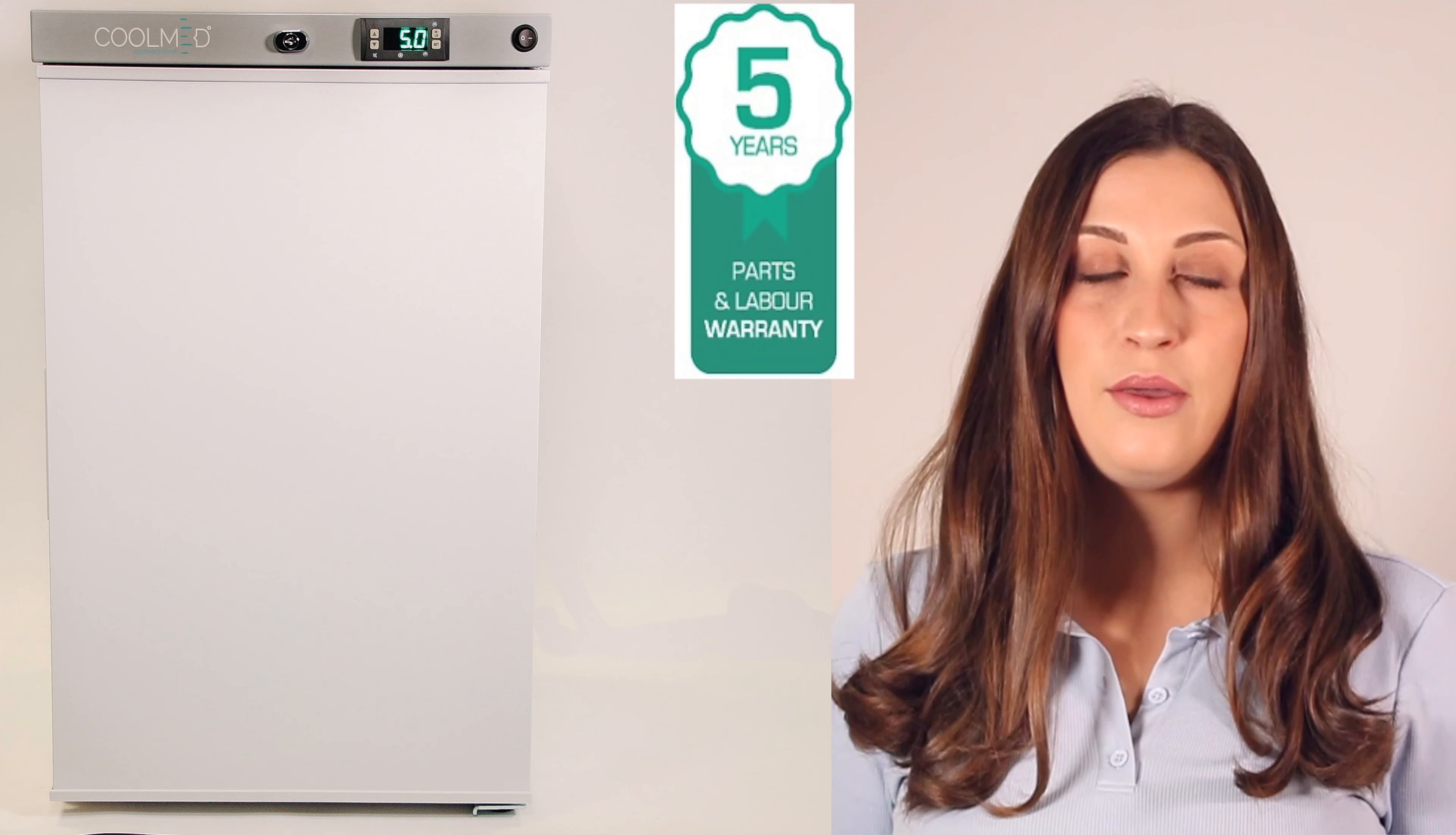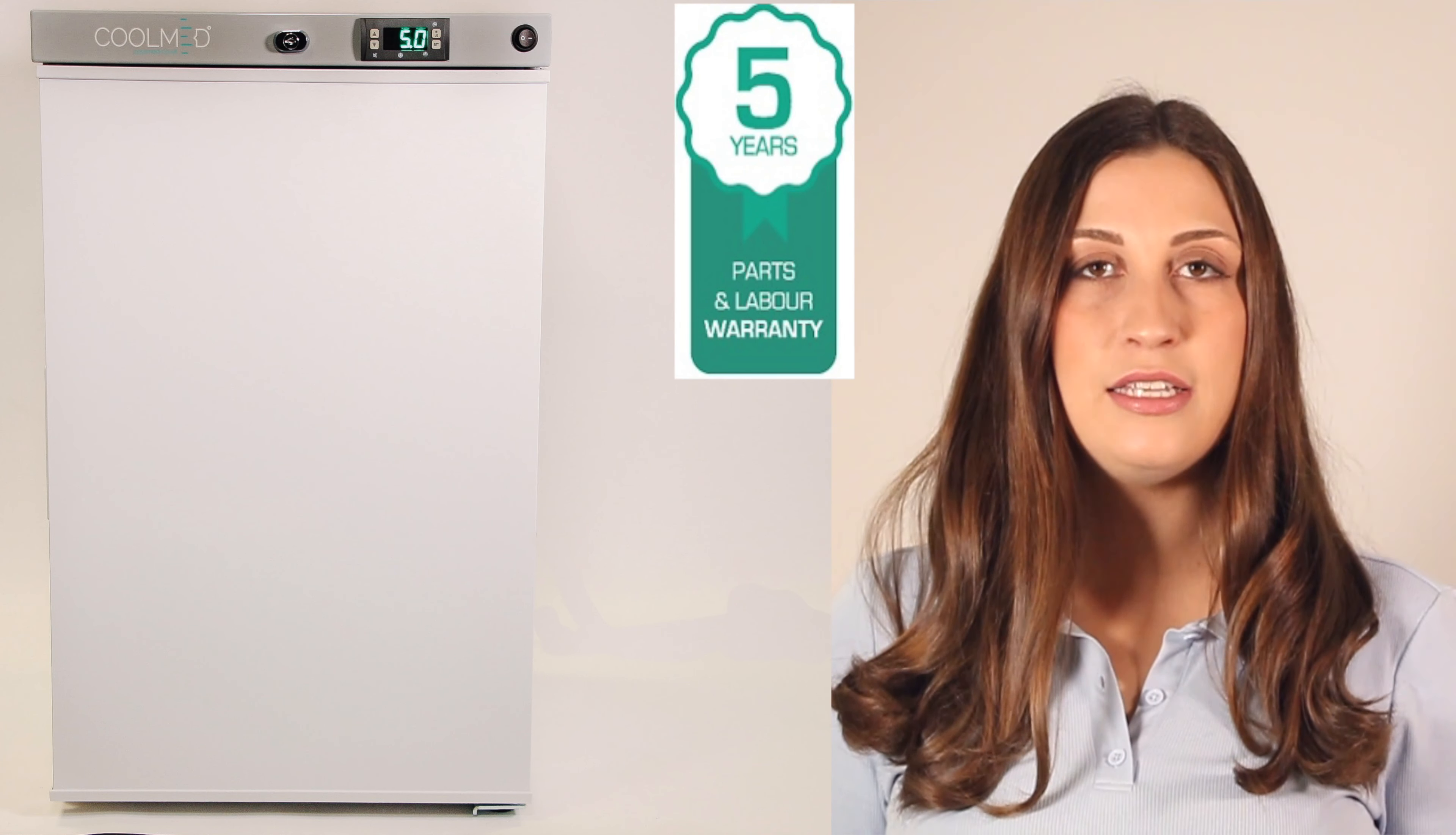This product has a five-year warranty with the option to extend to seven years for extra peace of mind.